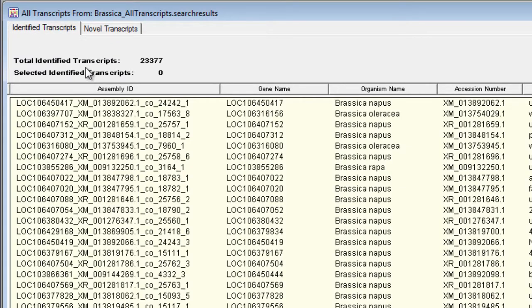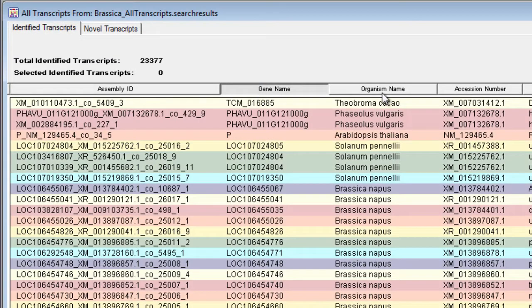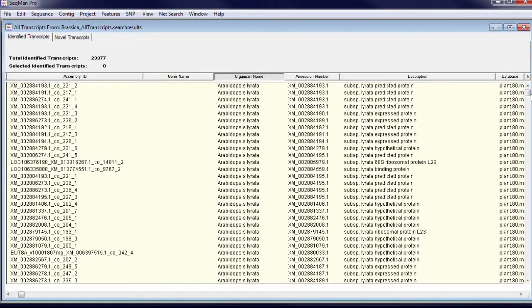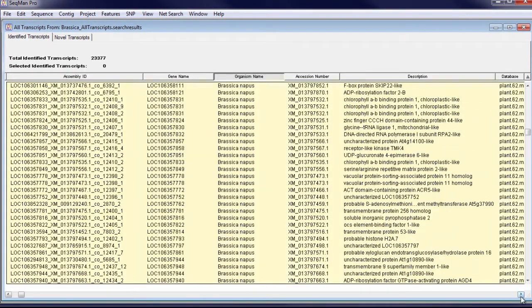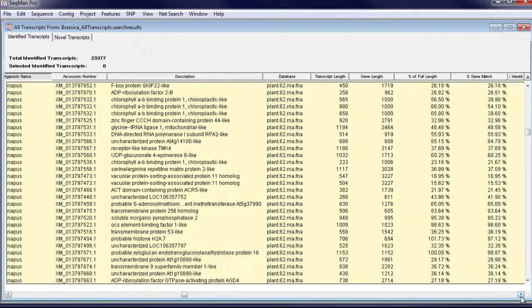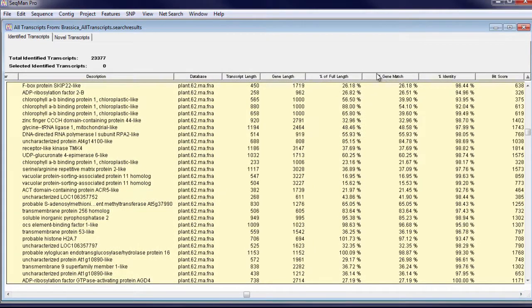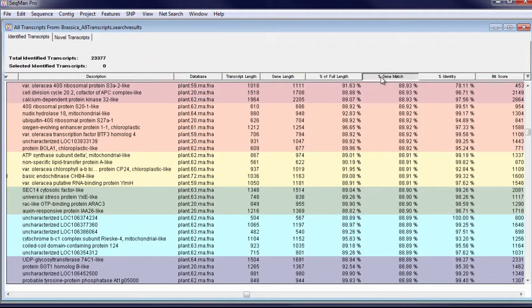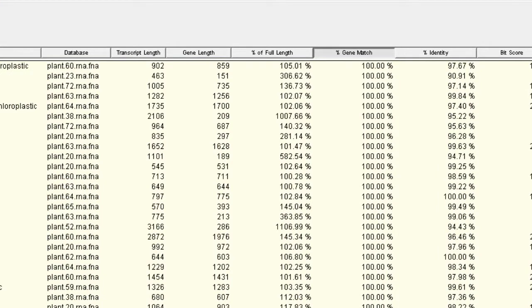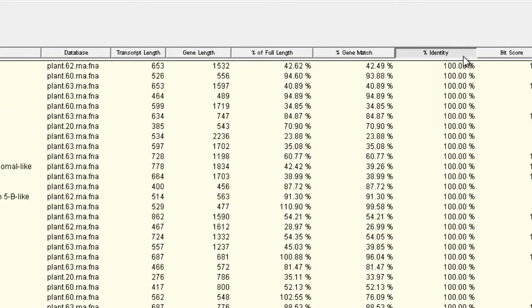You can sort this table by any of the available columns — for example, gene name, organism name, percent gene match, which describes how much of the gene in the database matches the assembled transcript, and percent identity, which describes the similarity between the assembled transcript and the matching portion of the RefSeq gene.